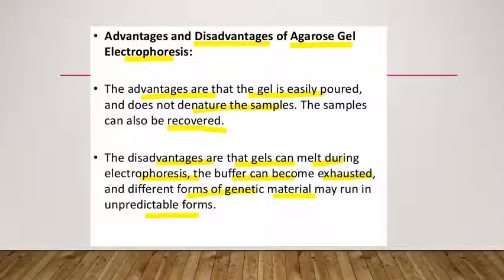If the run goes on for a longer period of time, the buffer can become exhausted and the gel can melt. So you have to take measures to prevent all these disadvantages in order to take advantage of the method.